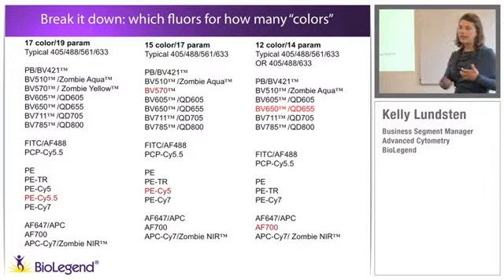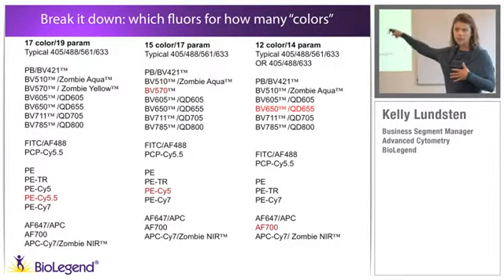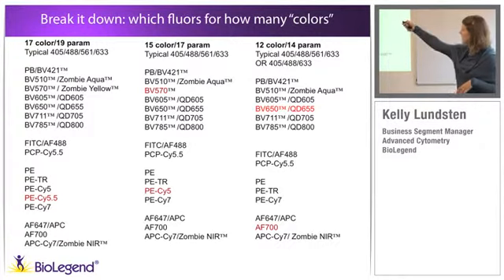So those are the kind of strategies that we look at when we're trying to consider how to match the fluors. So once we get to 16, 15 would be every single marker in this particular middle list.